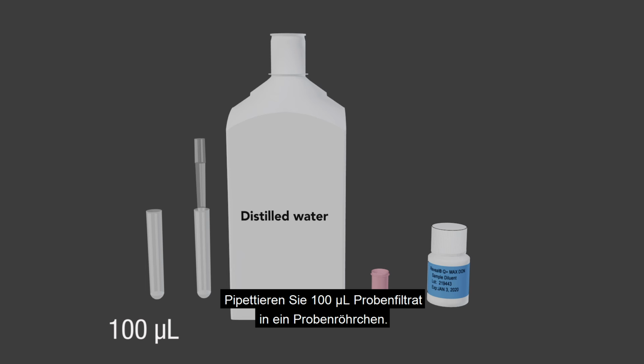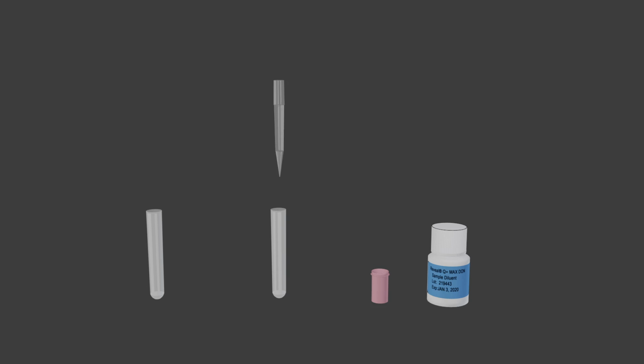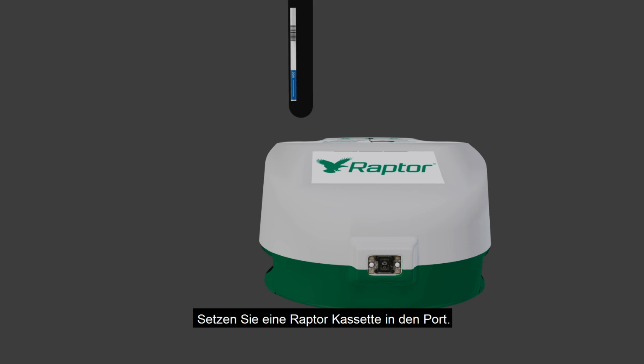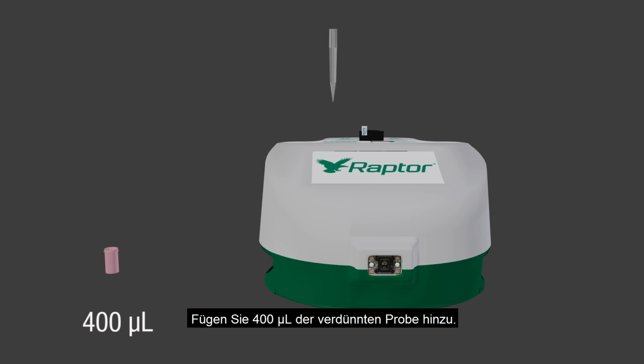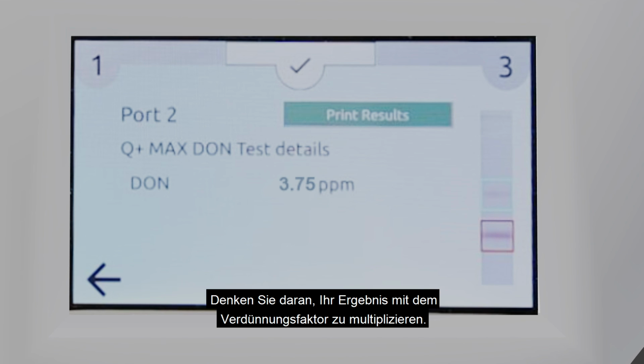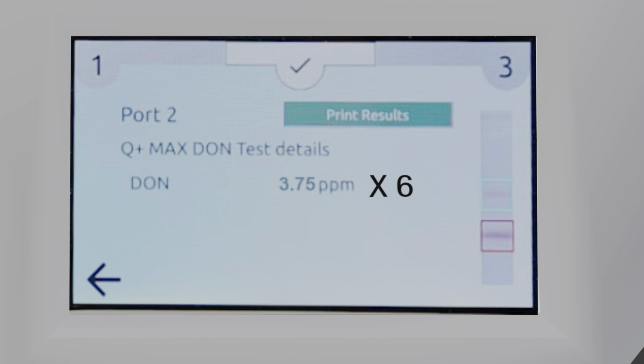Add 100 microliters of sample filtrate to a sample collection tube. Add 500 microliters of distilled water and mix well. Transfer 100 microliters of the sample dilution to a red dilution cup. Add 1,000 microliters of sample diluent and mix well. Place Raptor cartridge into port. Add 400 microliters of sample to cartridge. Result will be displayed. Remember to multiply your result by the dilution factor. For this example, multiply by 6.